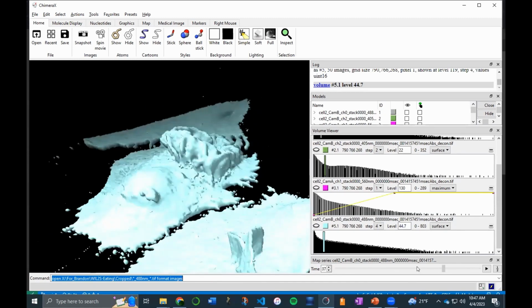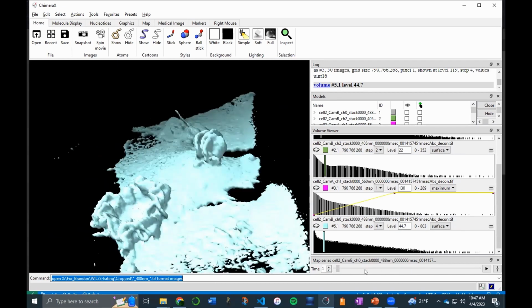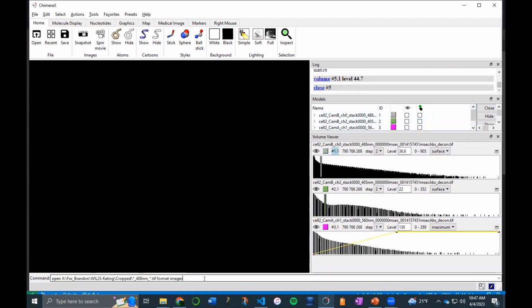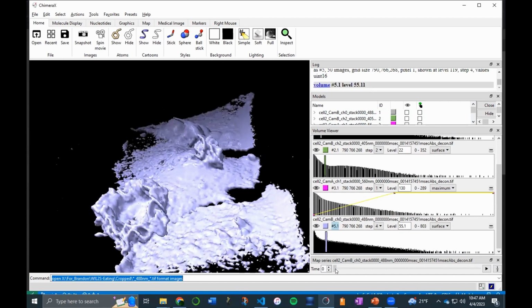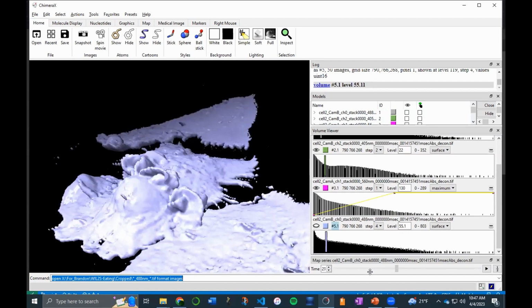It is going to be unmatched. So that was opening the series of TIFF files and generating isosurfaces, and that was basically faster than I can sloppily click between them. So if we try and do that again to show here, opening those guys up, you can see it's happening near instantly as we now select any of these other views that we want.